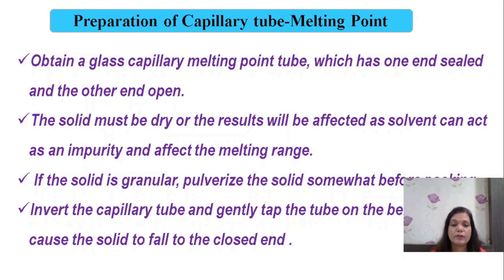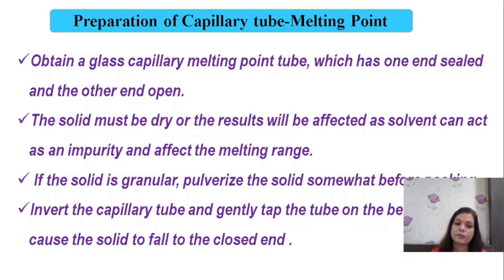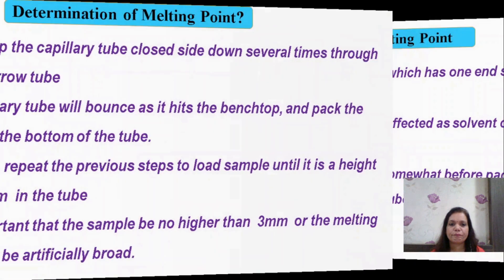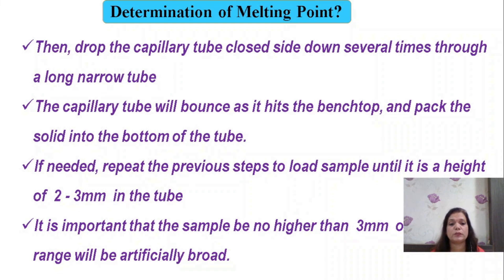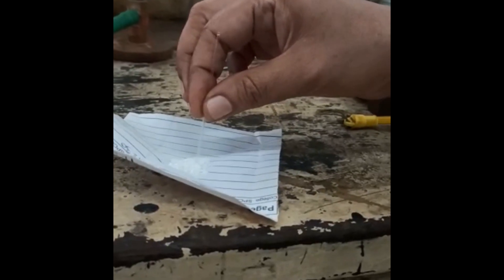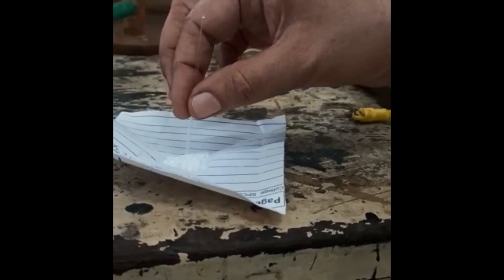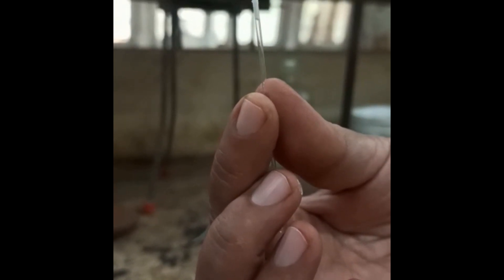You have to take care that when you are filling the substance, the amount of substance must not be too much inside the capillary, as this may also require a higher temperature to melt that particular substance. When filling the solid substance inside the capillary, just press over the substance and do some circular movement. You can see that the substance has gone inside the capillary.